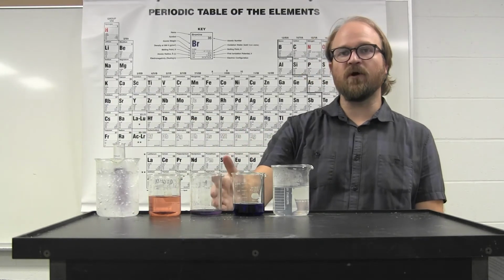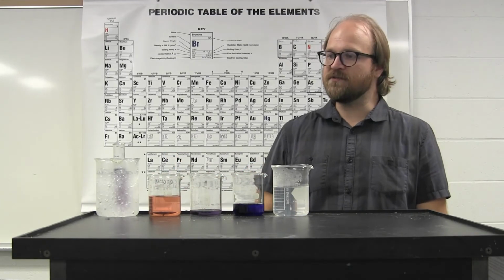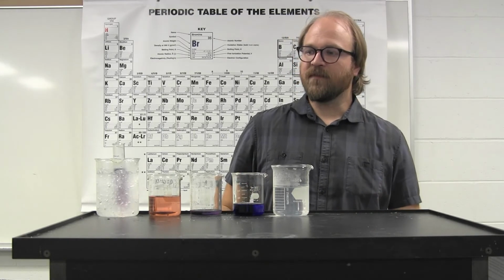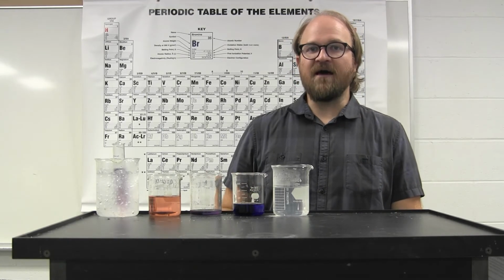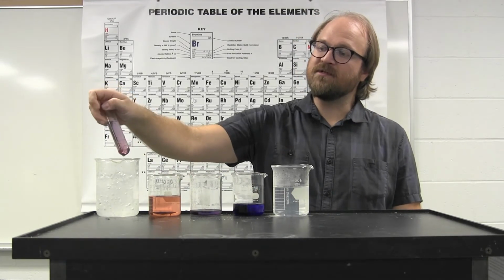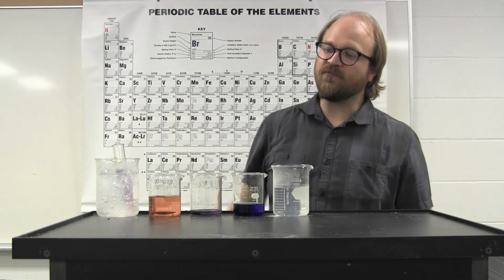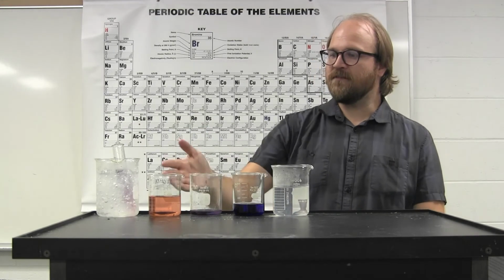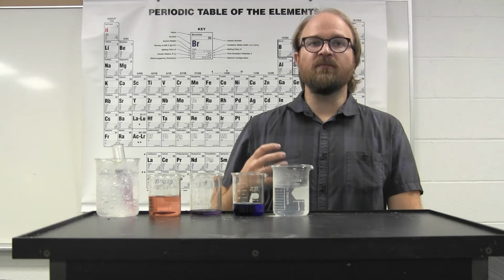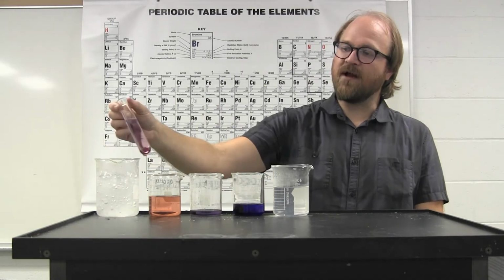By placing the purple blend in an ice mixture for a few minutes or so, the equilibrium shifts to one side. This can be seen because after a few minutes or a couple of seconds, you can see that it's noticeably much more red than it was initially, especially towards the bottom of this test tube. As it's cooling down, the equilibrium shifts and favors the red hexaaquo complex.